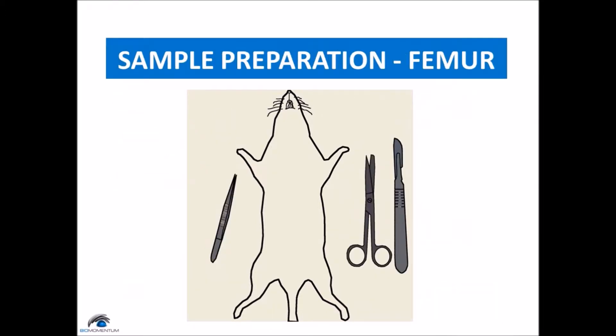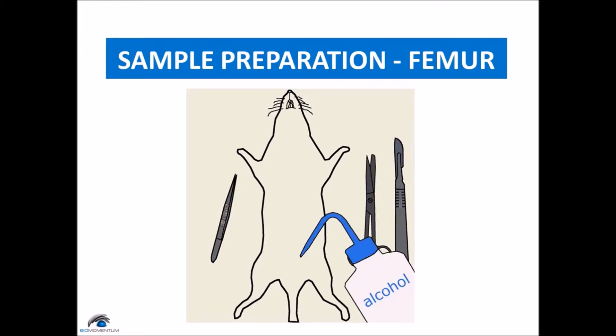If the rat is frozen, partially defrost for two hours in the refrigerator to facilitate manipulations. Lay the rat on its back and clean the skin of the lower part of the abdomen by saturating it with alcohol. This will also help to prevent cut hair from spreading.